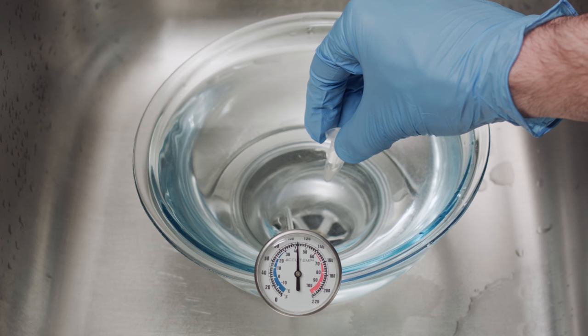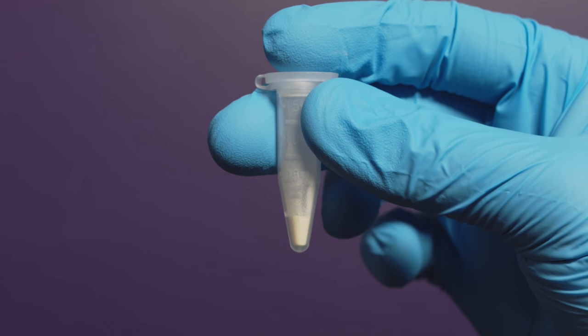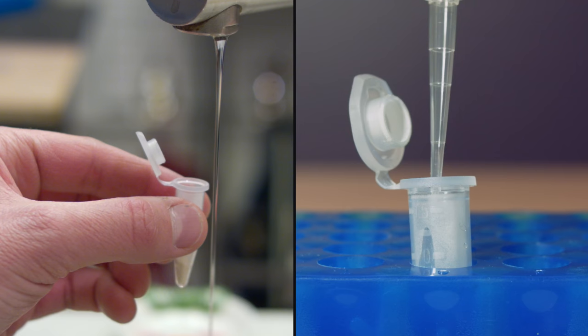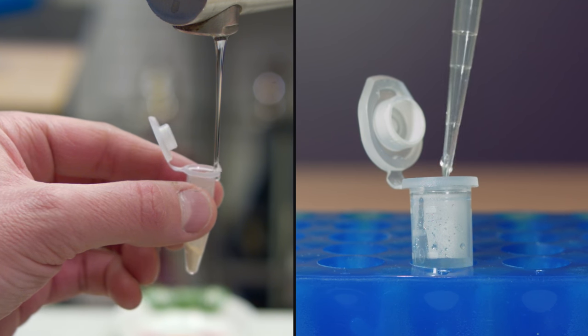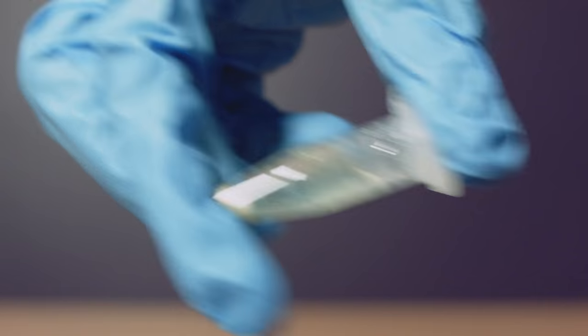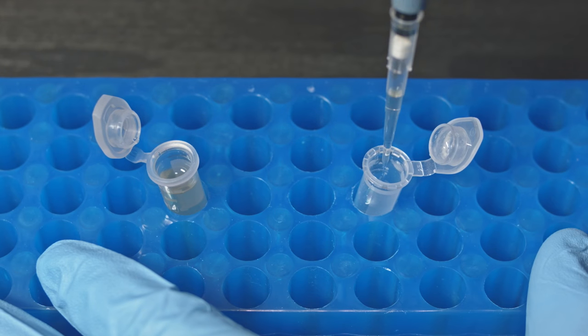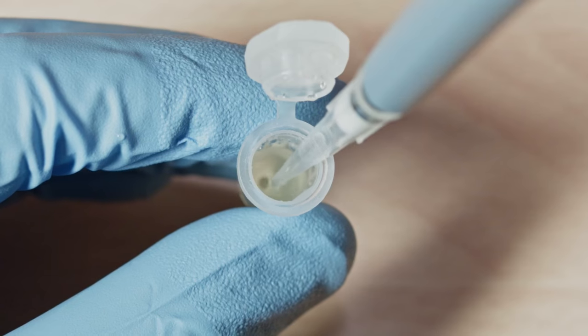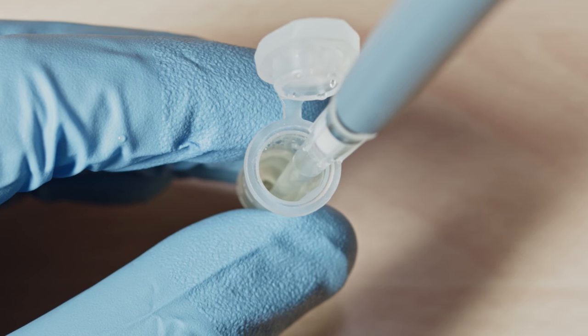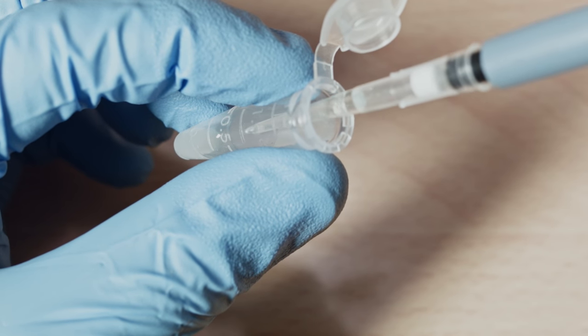After the heat shock, it's time to add the food. Grab a microcentrifuge tube of LB media for the E. coli competent cell mix and a YPD one for the yeast. With room temperature water, fill each tube to the top. I used a pipette for the LB media, but feeling more confident, I used a tap for the YPD media. Shake the tubes until all the media is dissolved. Pipette out 900 microliters of YPD media into your yeast competent cell mix. Discard the tip. Add 200 microliters of the LB media into the E. coli mix. This pipette can only do 100 microliters, so you'll need multiple trips. And then incubate.